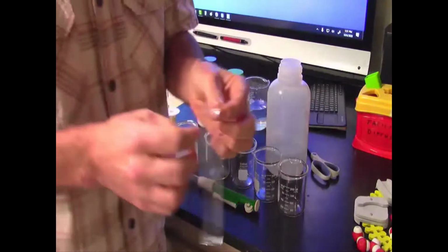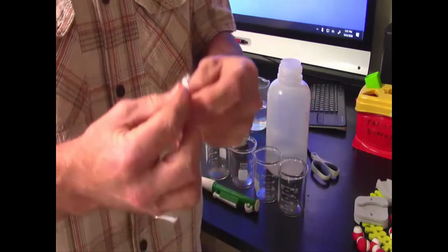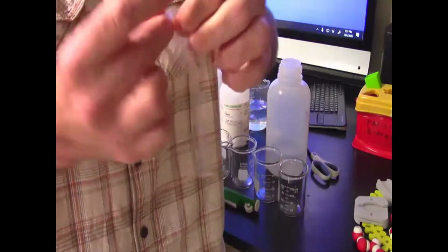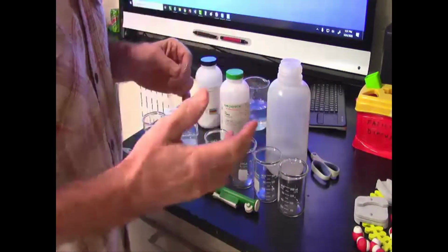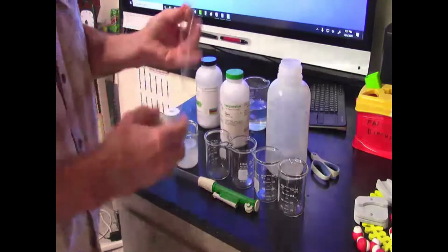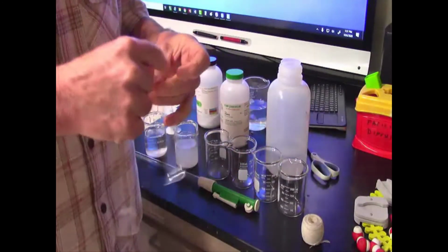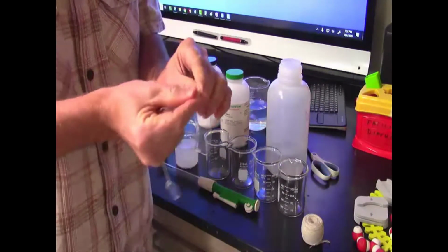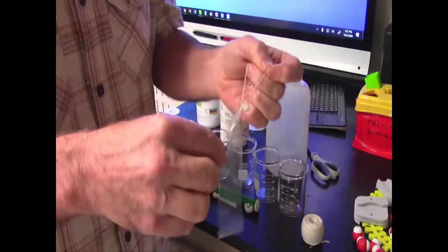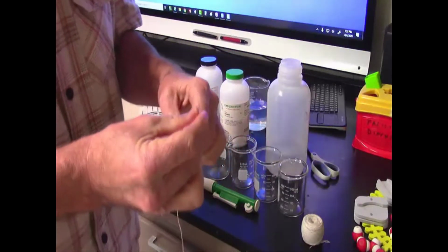Okay, so the dialysis tubing is pretty close to hydrated enough, and it is tubing. It didn't seem like it at first, but there's a hole that's going through there like that. And so I'm going to make this into a fake cell, a surrogate for an actual cell. So I'll just take a little bit of string and make it more or less waterproof here, twist it, fold it. This end is tied.